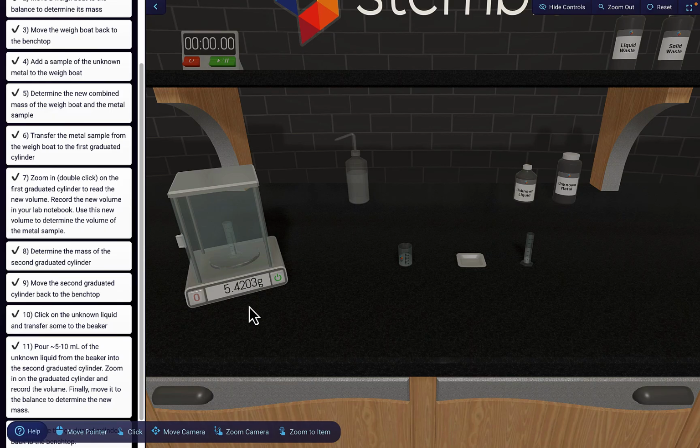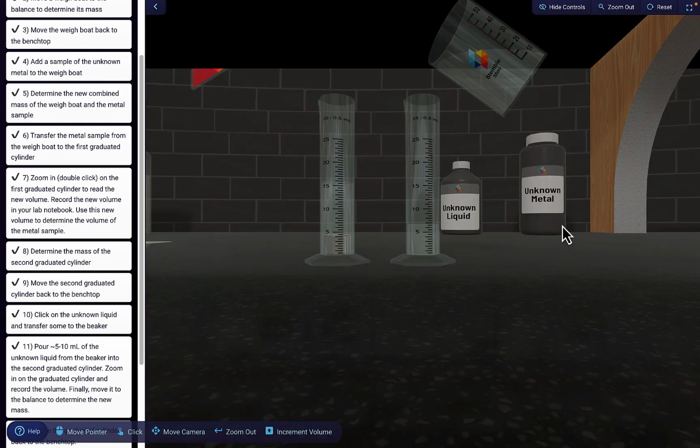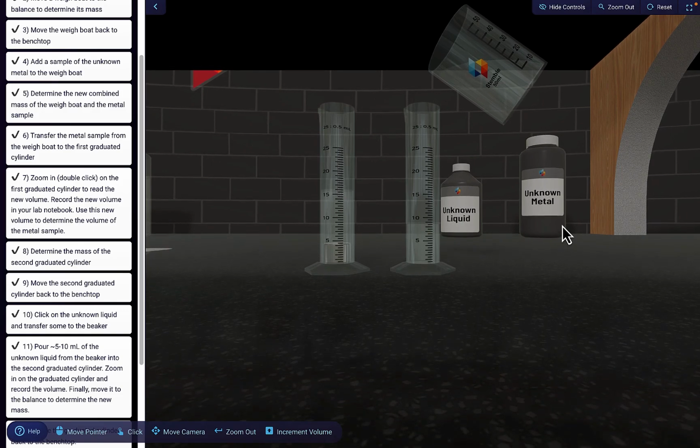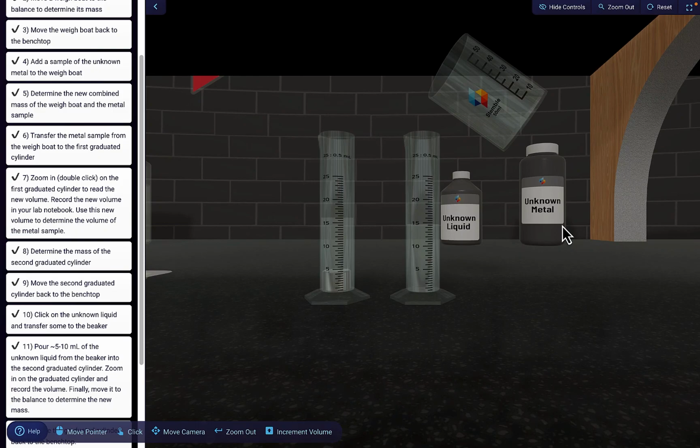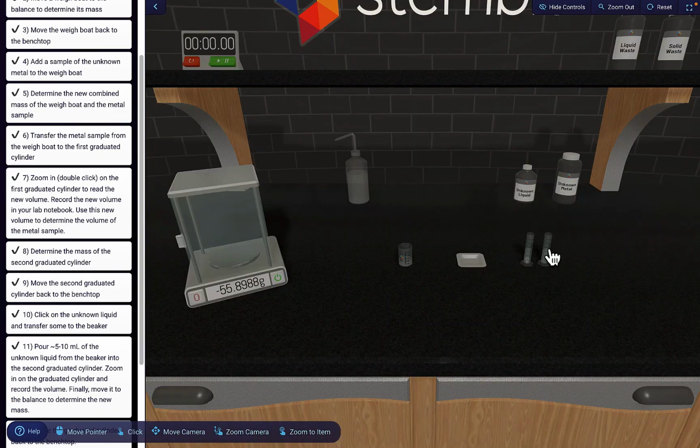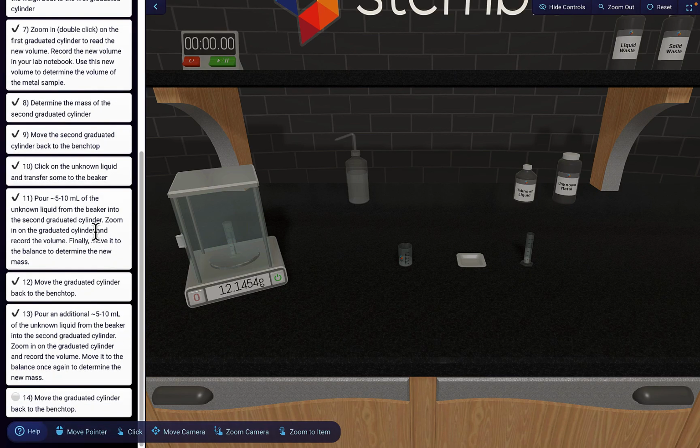But with a liquid, we can actually go a few steps further and repeat this measurement to get a number of different data points. Let's go back to our beaker and put more liquid into the graduated cylinder to take successive measurements of different volumes of this liquid and their associated masses. In all, this experiment calls for 3 total measurements like this.